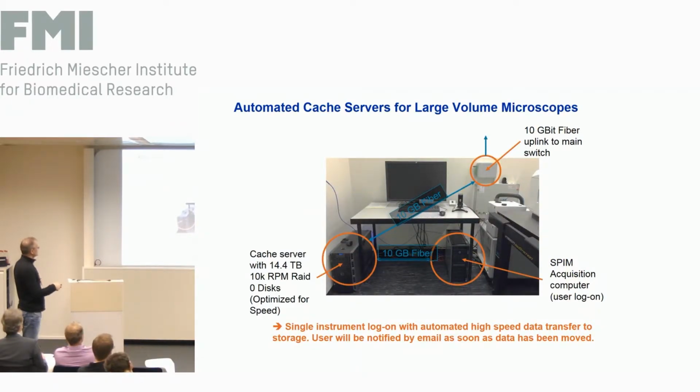That's actually just the layout of a light sheet. You have the operating computer, which is standing down here, operating the microscope standing here, and because it's a lot of data, the data is temporarily stored down here. Dean mentioned something very important. We stay pragmatic. We realized it's not important that the data is immediately available, not if it's 1 terabyte. It should be available quickly.